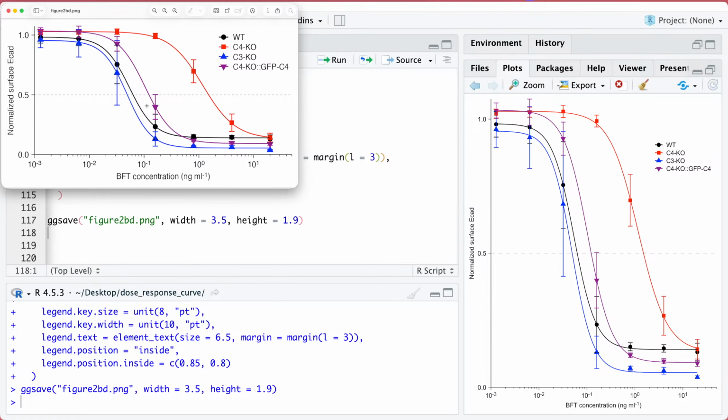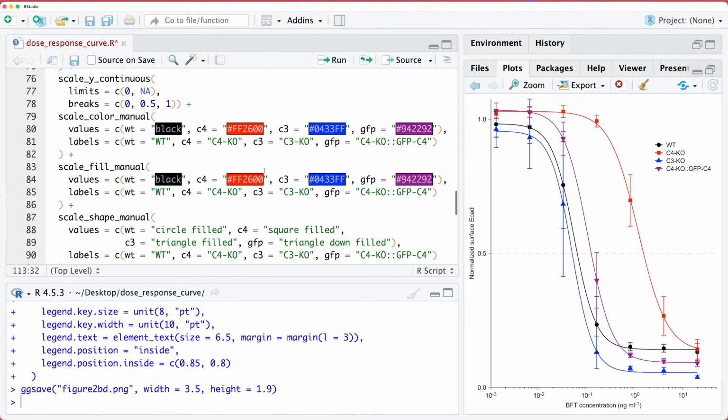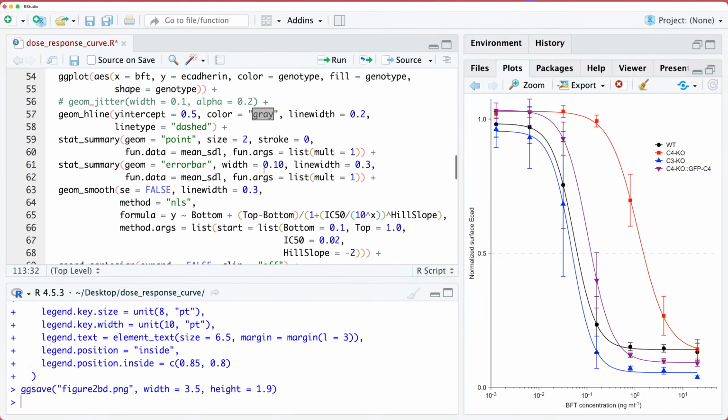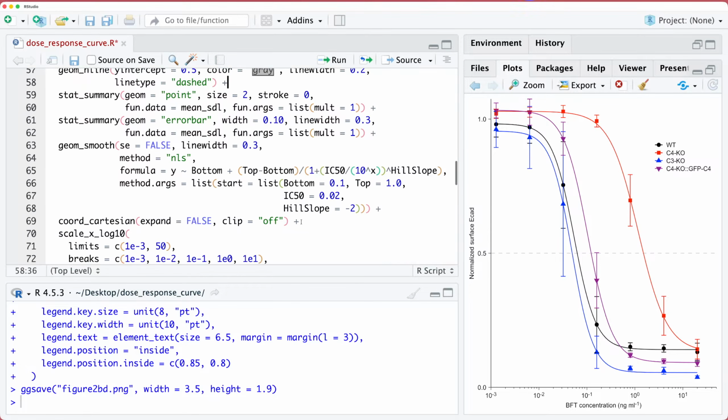All right, so what I'd like to do now is try to draw a colored line coming up from the x-axis showing where the IC50 value was. And I think you can kind of already see where the IC50 values are just by putting in this dashed gray line. But let's put in the fitted value. And so to do that, I am going to come back up here, and it's going to be the same color, right? So it doesn't really matter where I put it.